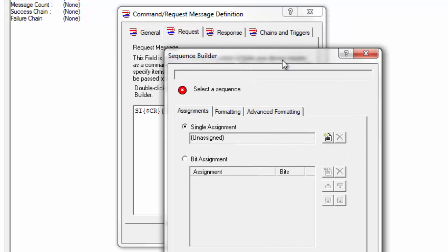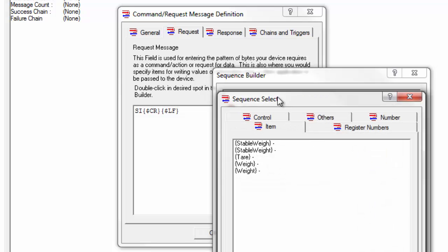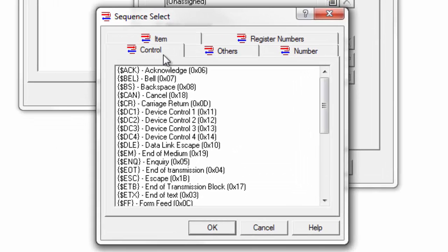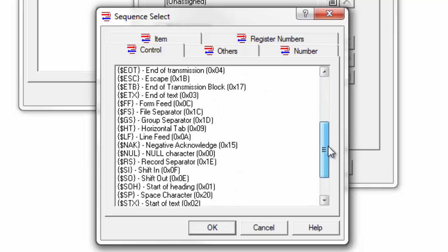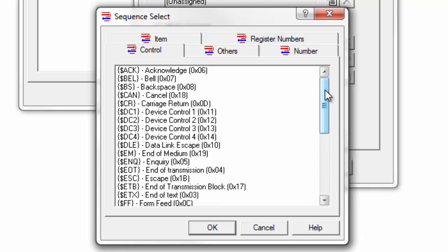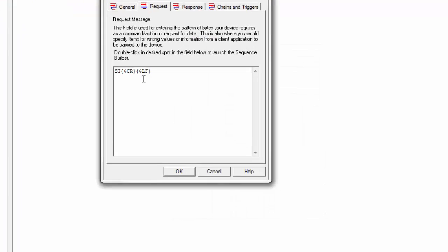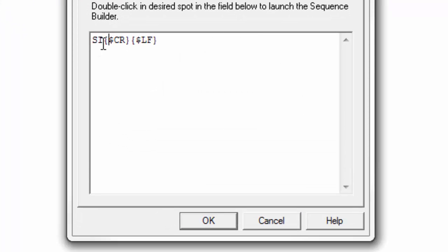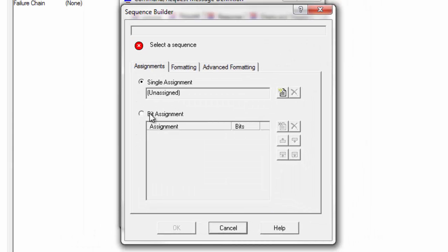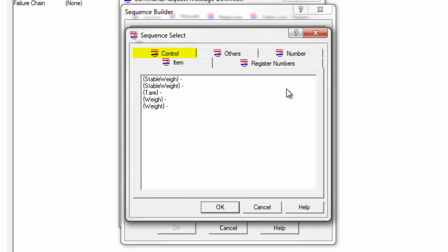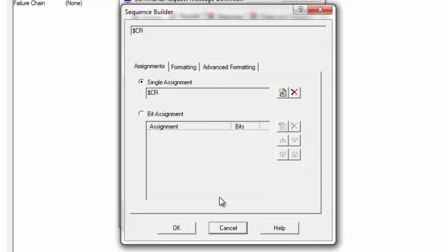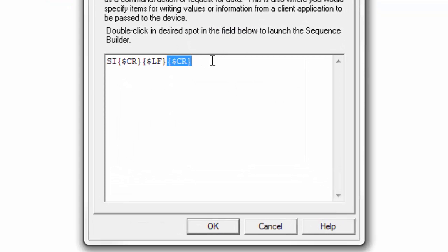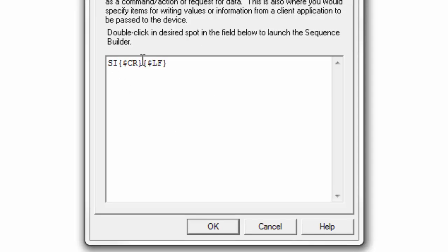You can also go into the sequence builder by double-clicking in the white space and going to single assignment. We have a whole section of control characters — your carriage returns, your line feed, your end of text, your start of text. You can go into sequence builder and select those, or you can just freehand type those with curly brackets surrounding a dollar sign CR, dollar sign LF. Once you've used Omni Server for a while, you get used to the syntax and can just type those in. Otherwise if you're just getting started, double-click, go to single assignment, change assignment, and you can select those characters there.